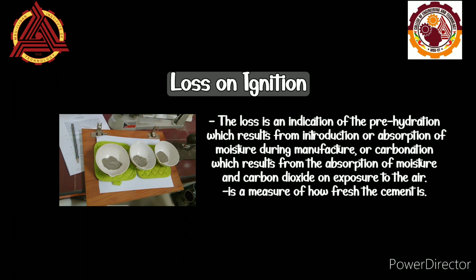If cement stands in a humid atmosphere, it may harden even if still in bags. Cement that has deteriorated this way, if reground and placed in the market, can be detected by excessive loss on ignition. Therefore, the loss on ignition is a measure of how fresh the cement is.